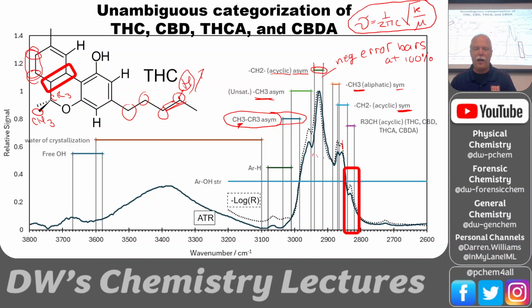You also have the aromatic hydrogen stretch. So we have this aromatic hydrogen. So we've got a couple of those right here. Okay. And we got 2 little peaks there too. So it might be the symmetric and asymmetric stretch for those things. We could have the 2 stretching together symmetrically or asymmetrically. Okay.